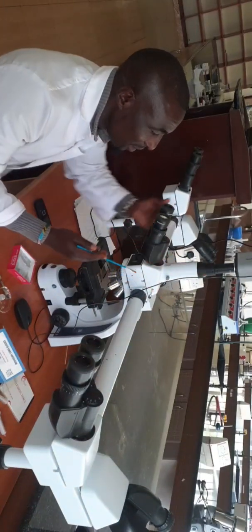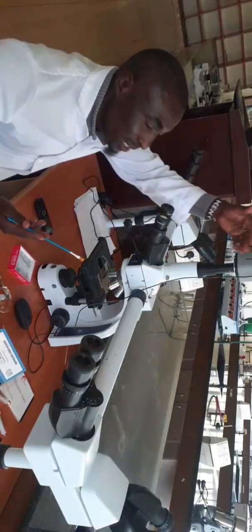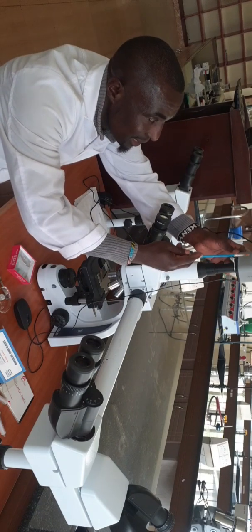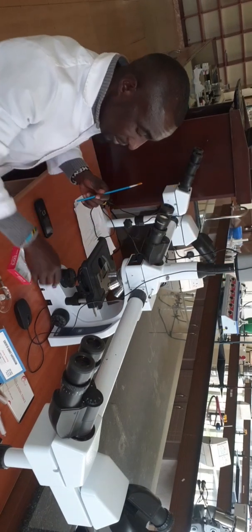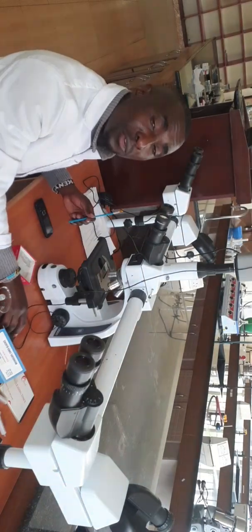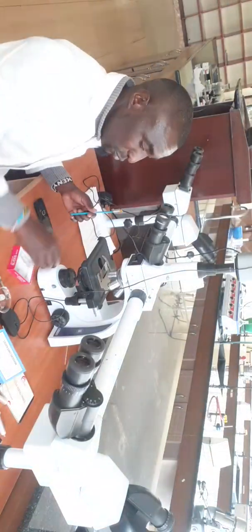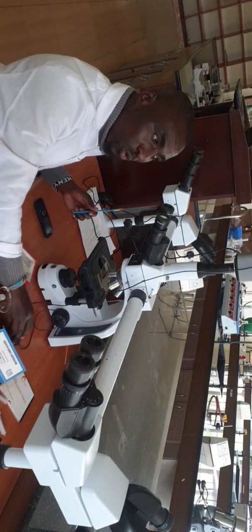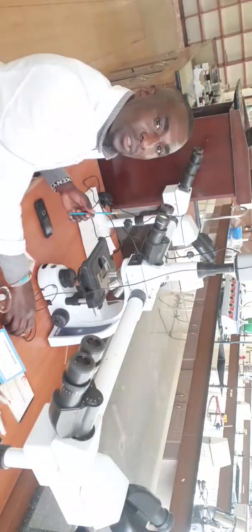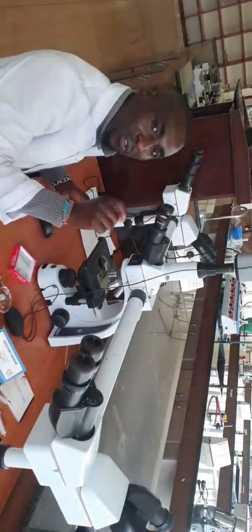This microscope is more improved, whereby you can mount a camera on top of it. So this is the camera. The camera has a mouse to ensure that when you are projecting your specimen on the TV or on a screen, you are able to locate the specimen using a mouse, and even take a photo of the video you are showing.